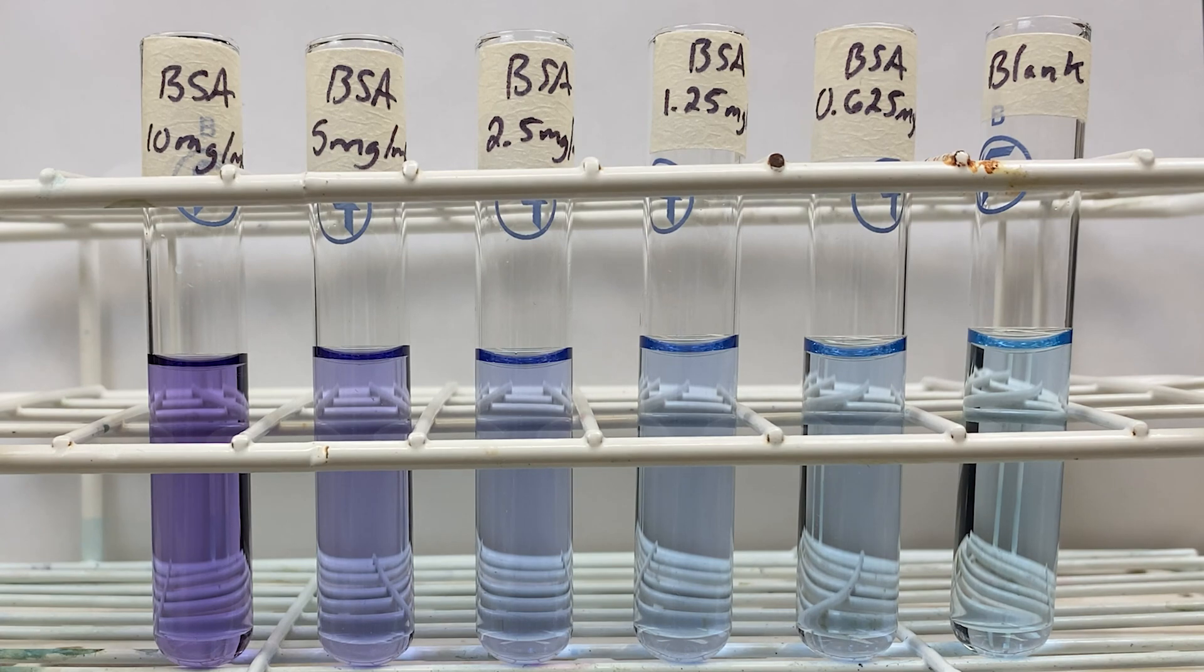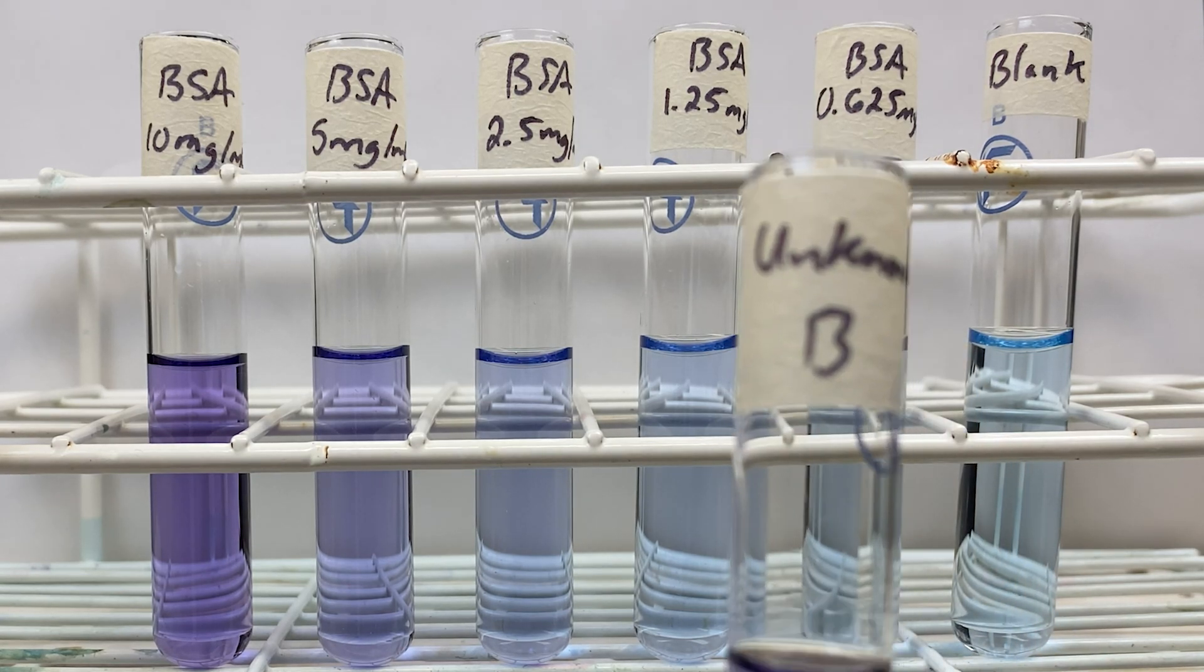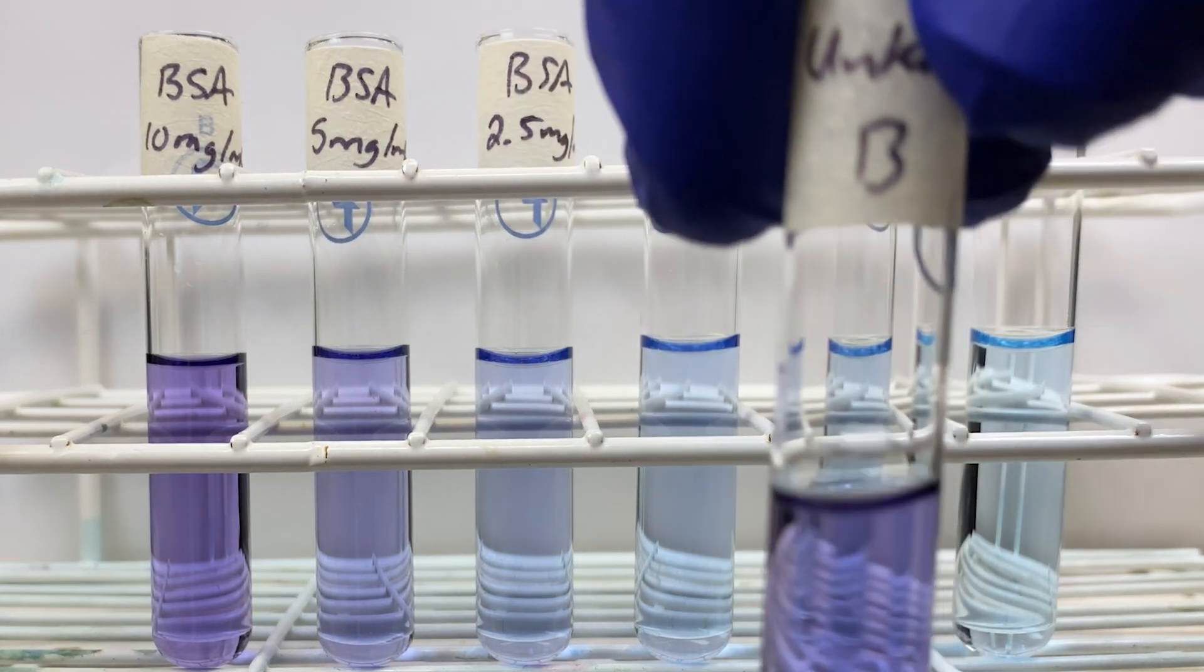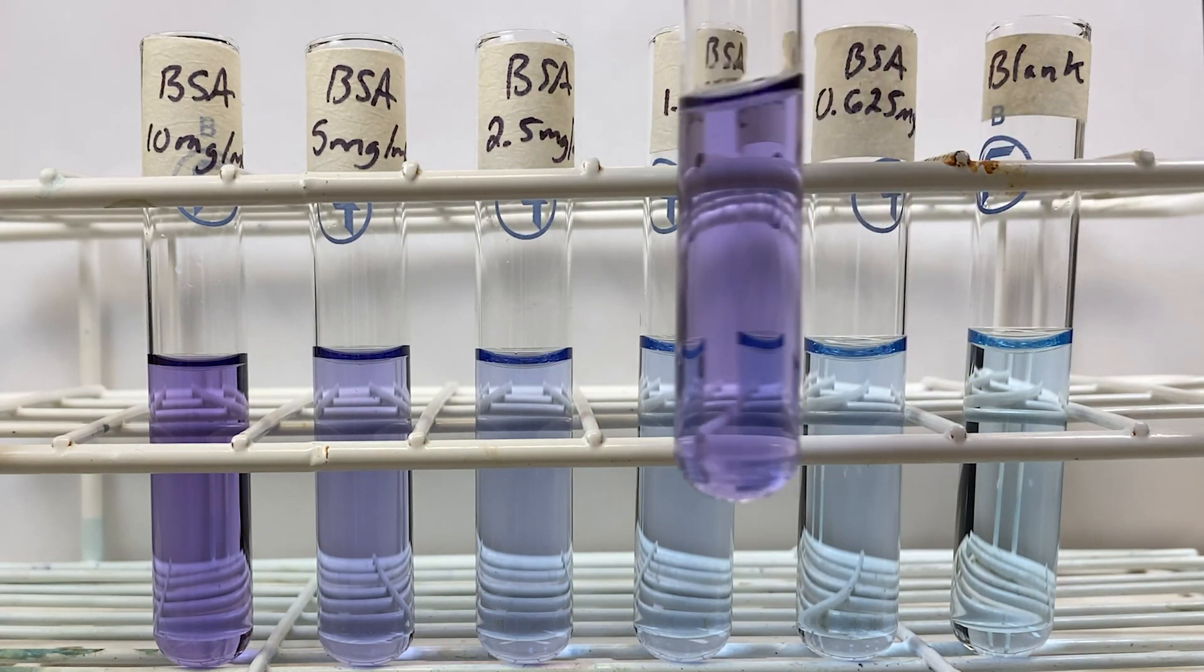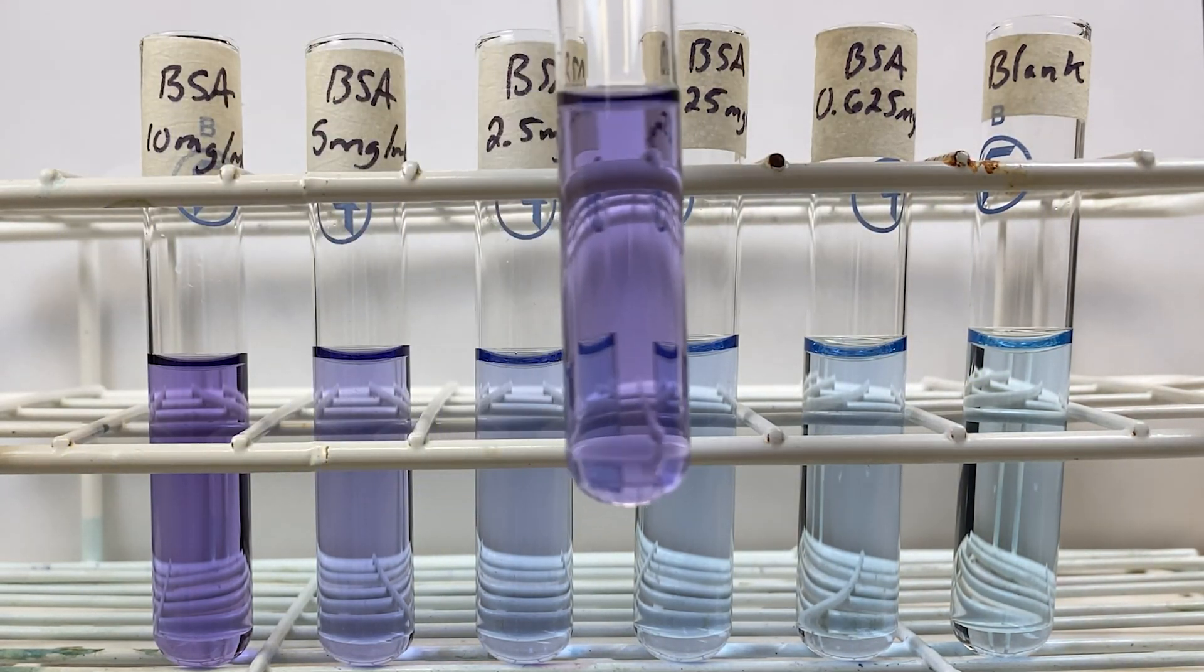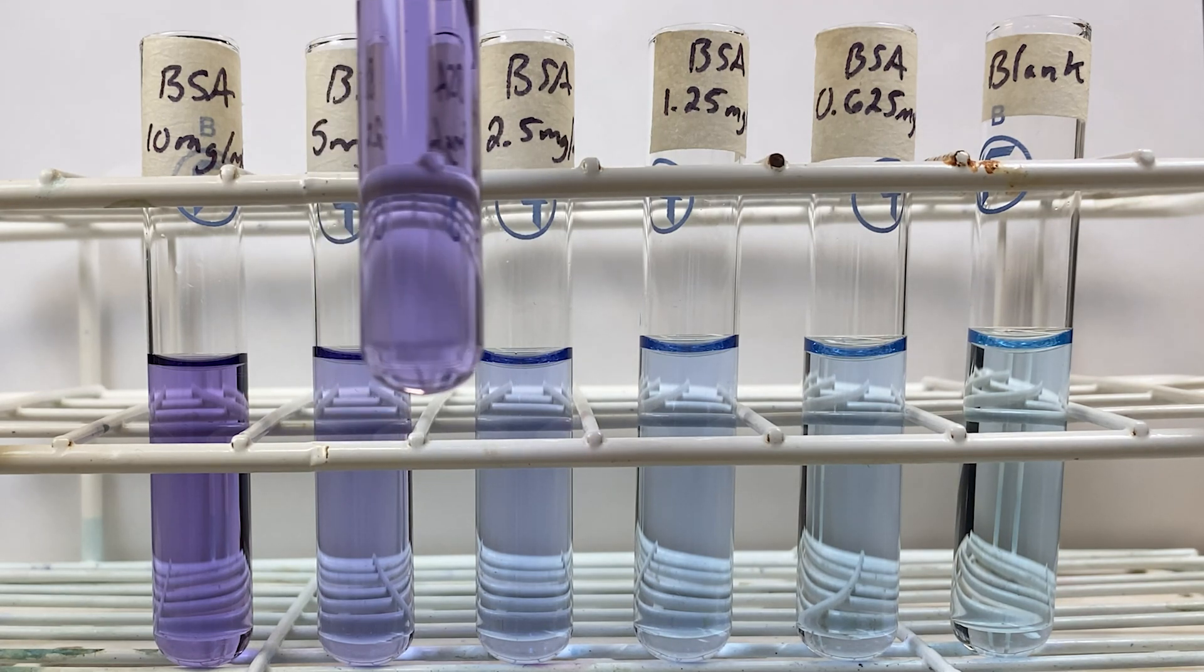We can do the same with unknown B. Here, it's quite a bit darker. It's closer to 10 milligrams per mL. Maybe somewhere between 10 and 5 milligrams per mL.